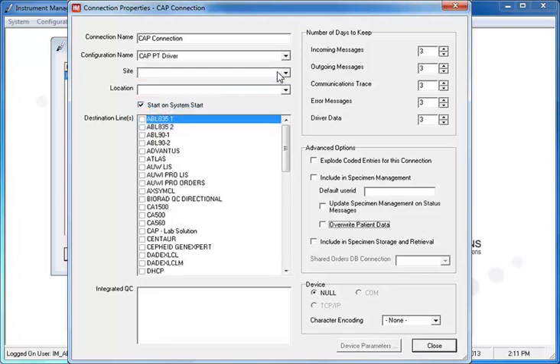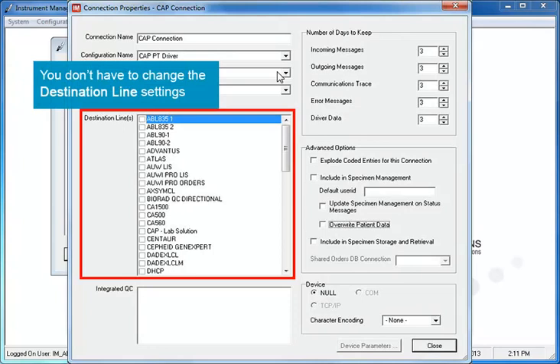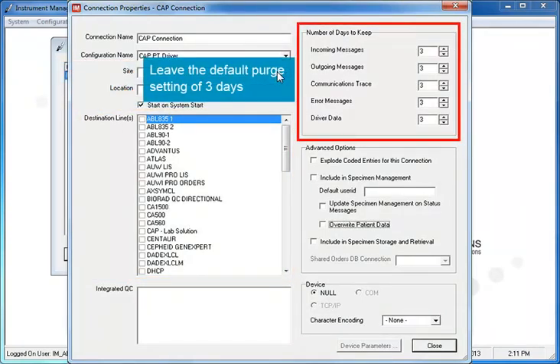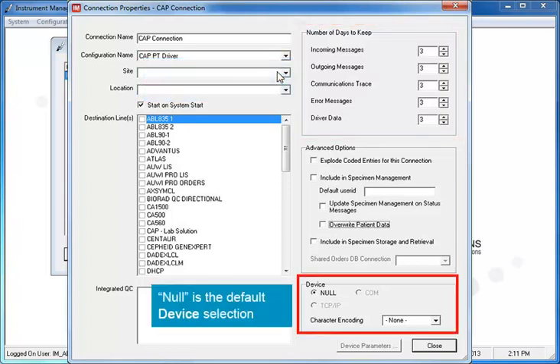Because the driver is an outbound, unidirectional driver, it doesn't ever send data to other connections, so you don't have to change the destination line settings. Leave the default Purge setting of three days. Null is the default device selection.